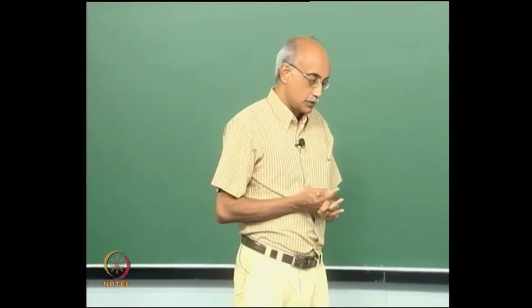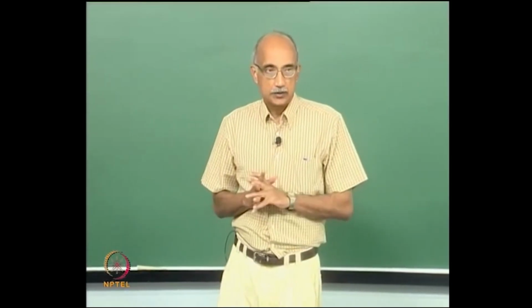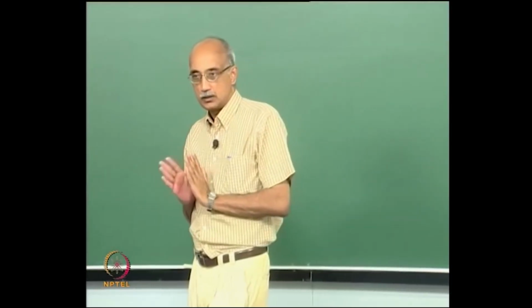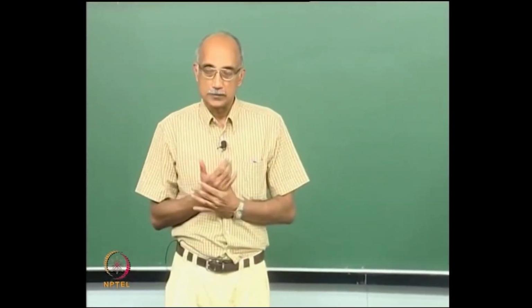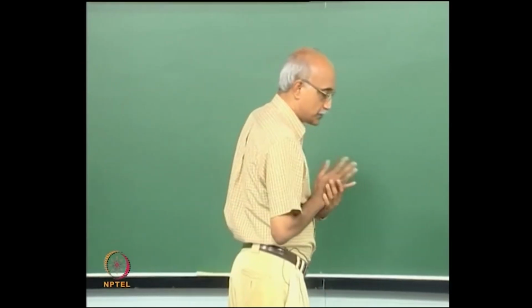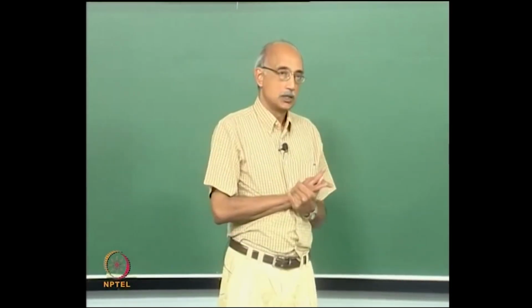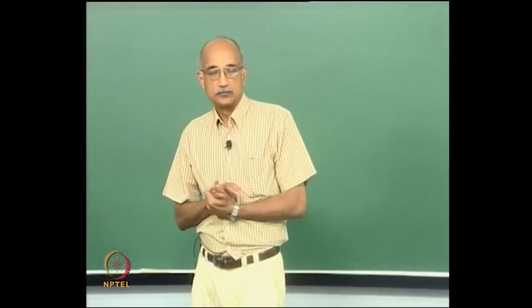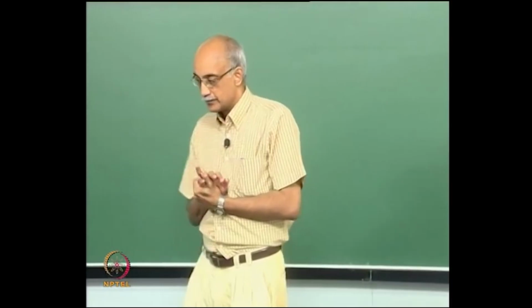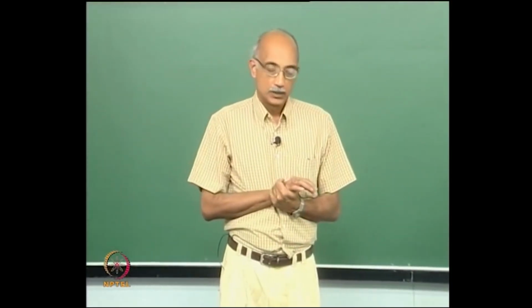We also need to discuss a little bit about how our methods of size characterization need to be adopted for nanoparticles. So, we will do that in the first part of this lecture, and then we will spend some time reviewing the material that we have covered so far in this course. I will try to pose some questions that you can use to test your understanding of the material.